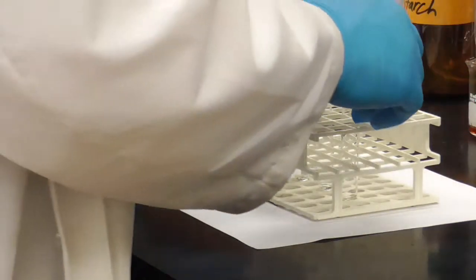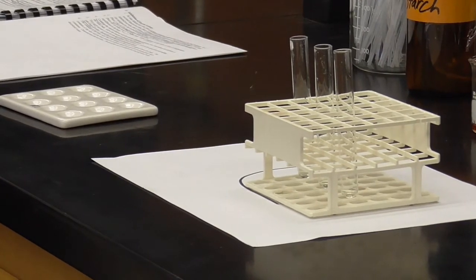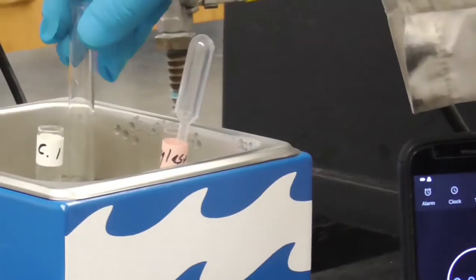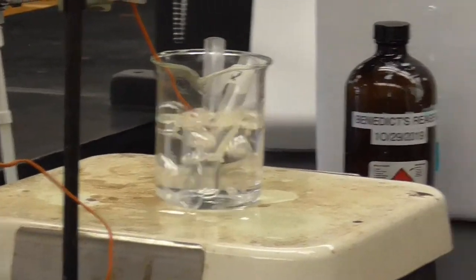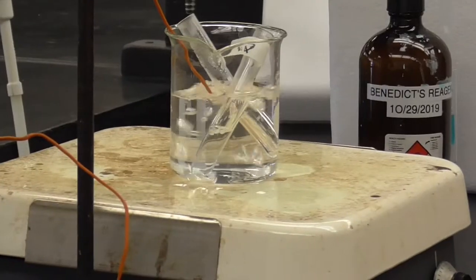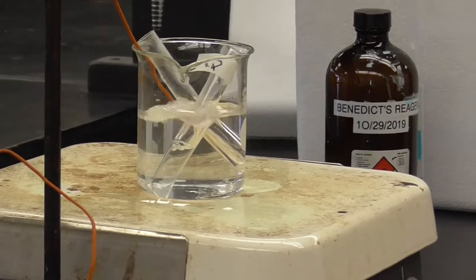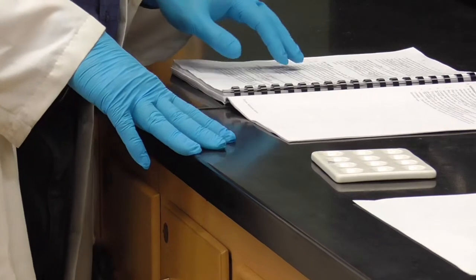And we just want to bring those to the same temperature, I believe. Let me just double check that. And place 1 in each bath, right? So here we go. We'll take our enzymes and add them to the bath right next to our starch. So we're getting them all to be the same temperature. Okay. And the cold one right there. All right, as those come to temperature, let's go ahead and prepare our plate. Yeah, the procedure says to give them about 10 minutes or so to come to temperature. You probably don't need quite that long.